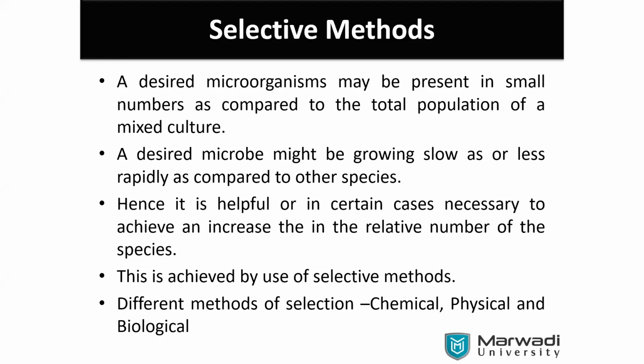So when you're looking for selective microbes, here we randomly got some microbes. Luckily or unluckily. When you are doing it with the soil sample, last time, that is why I haven't given the soil sample. I knew that even without a soil sample we are going to get so many things, right? If you had inoculated with the soil sample, so many beautiful colors would be there.